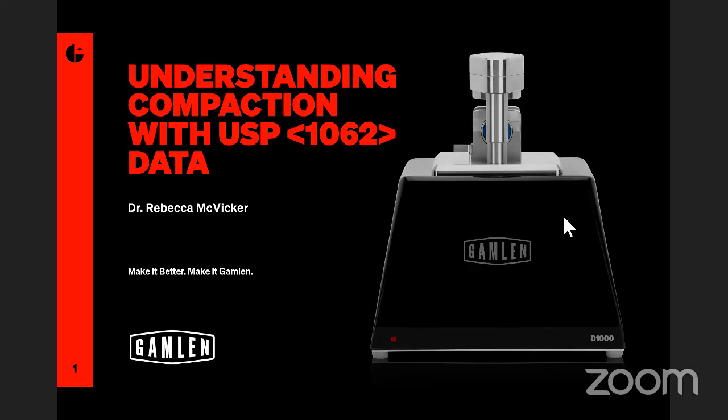I'm McVicker. I'm the product director at Gamlen, and I will be talking today about using USP 1062 data to better understand compaction. The United States Pharmacopoeia published chapter 1062 a couple of years ago. It's on tablet compression characterization.